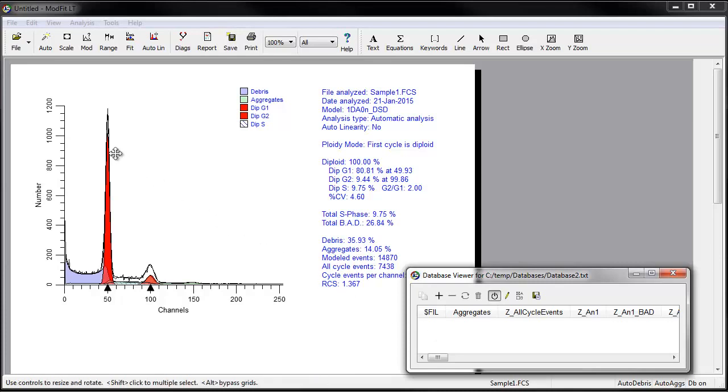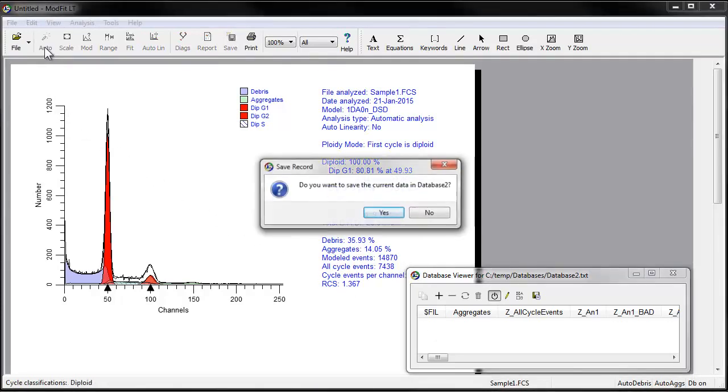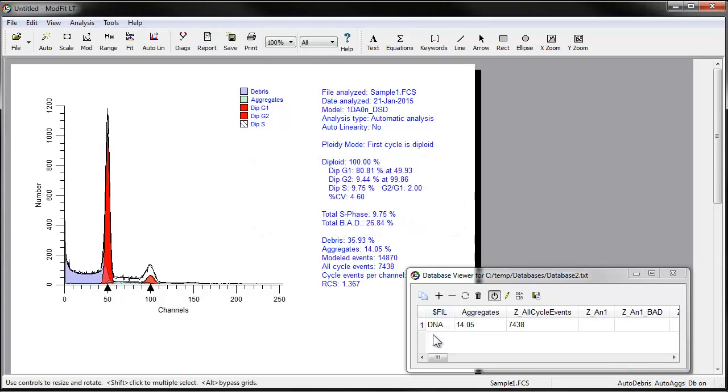Using these database features will prove to be useful, time-saving, and accurate, whatever your analysis needs may be. Oh, and by the way, the database will also work in the same manner when using the cell tracking and sync wizards too. Thanks for listening.